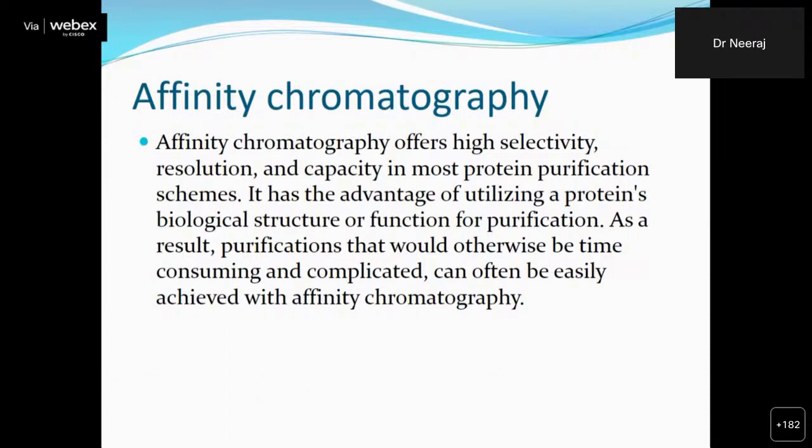Affinity chromatography is very important in research and development, especially for drugs in the human environment.